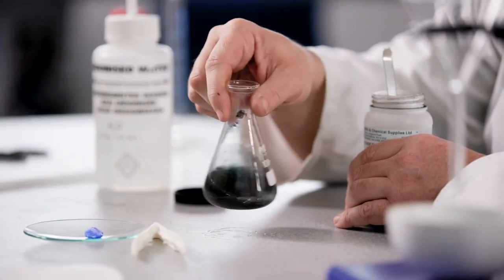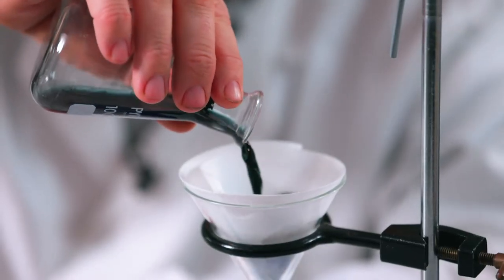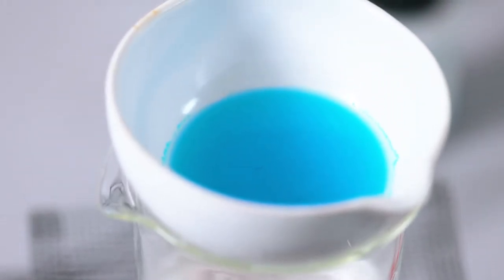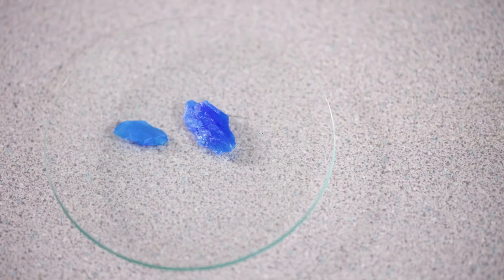The reaction we're going to be looking at today is between solid copper oxide and sulphuric acid. The produced copper sulphate solution will then be partially evaporated and after a few days pure copper sulphate crystals will be produced.